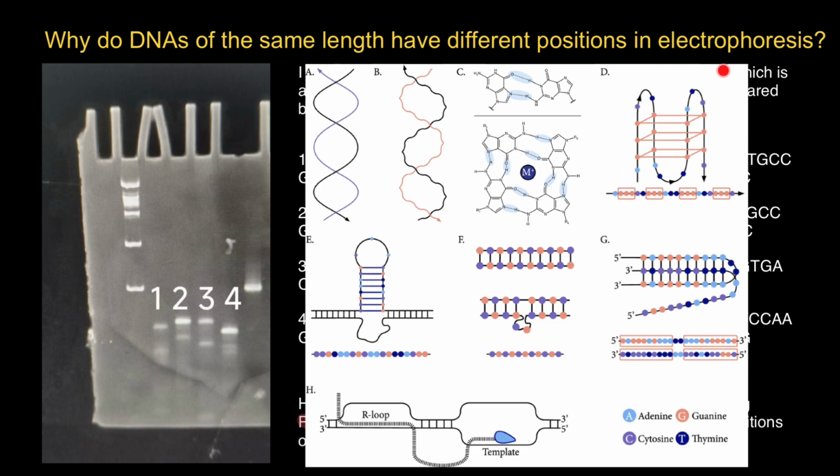Here's another example: the hairpins which are formed at inverted repeats, in which the stem base pairs hybridize with hydrogen bonds while the loop remains single-stranded. So here, here, and here. And here's another example of the stem and loop structure. Slipped strand mispairing at tandem repeats results in slipped structure formation like this.